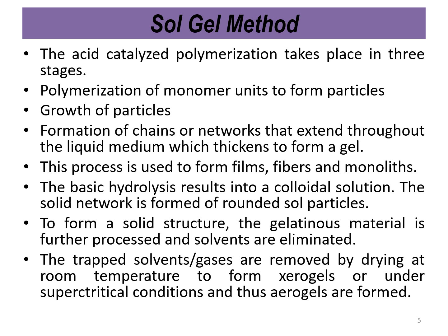So the solvents, for example, water or alcohol in which the reaction has been carried out, as well as this reaction goes on under air, so many gases are trapped inside the product, and we can remove the solvents or trapped gases by drying at room temperature, or we can do this removal at a little bit elevated temperature.